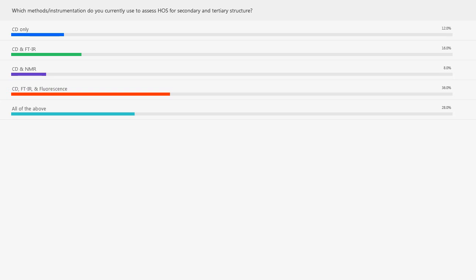Thanks, Jo. Yeah, that's quite a mixture. I'm quite intrigued by that, but it's good to know that CD, FTIR and fluorescence are all being used, and also then in second place, all of the above, so the NMR as well. So now I'm going to move on.